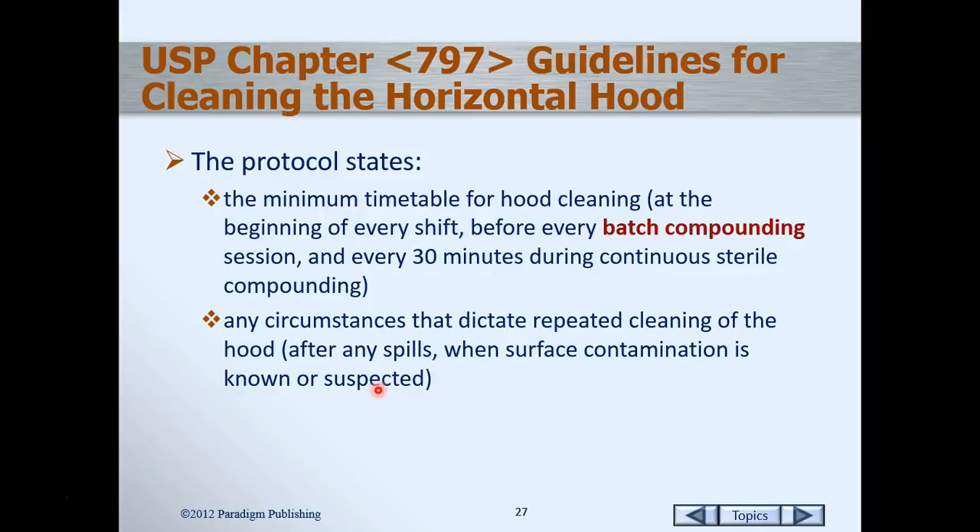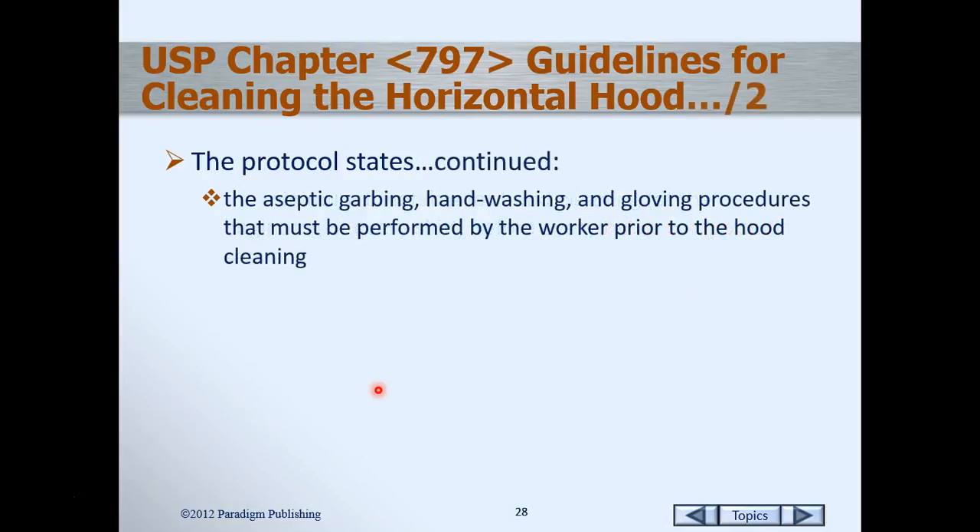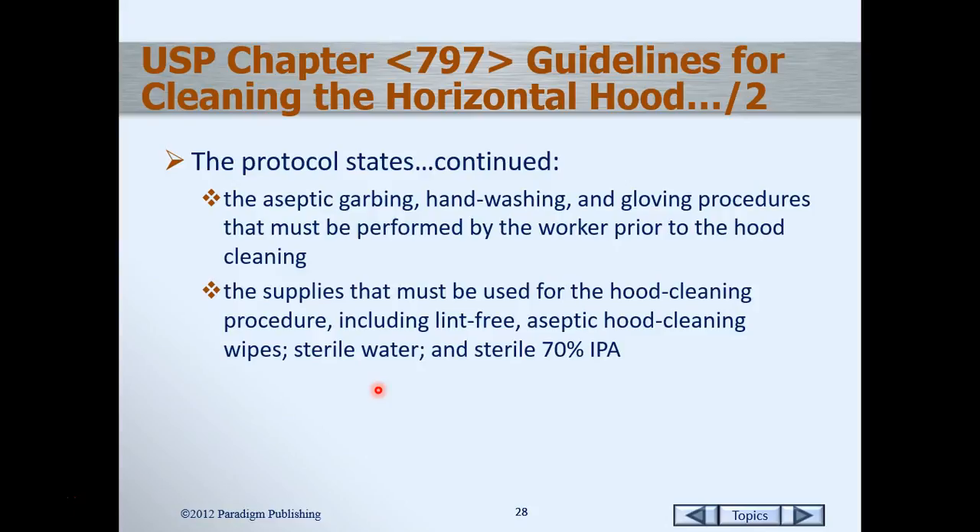If there's a minimal spill we can wipe it up with sterile isopropyl alcohol, but if it's more than five milliliters we have to clean the entire hood. In the clean room, aseptic garbing, hand-washing, and gloving procedures are performed before we start the hood cleaning — we complete garbing and hand-washing in the ante room, then do our gloving procedure once in the clean room. Supplies must be cleaned prior to being brought in. We also need to bring in certain supplies to clean the hood: lint-free and aseptic hood cleaning wipes, sterile water, and sterile isopropyl alcohol. There is a specific order for the hood cleaning procedure, which we will go through next.